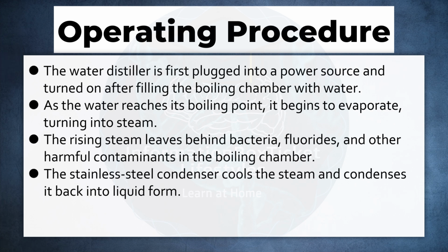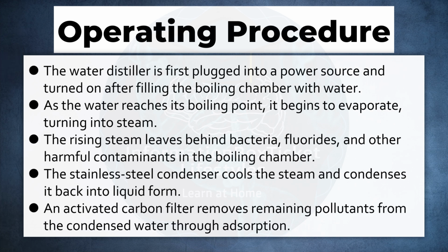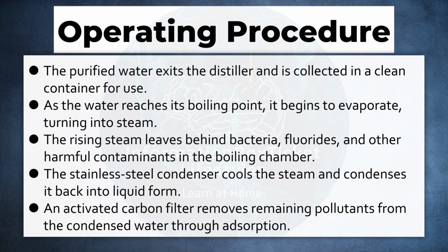The stainless steel condenser cools the steam and condenses it back into liquid form. An activated carbon filter removes remaining pollutants from the condensed water through adsorption. The purified water exits the distiller and is collected in a clean container for use.